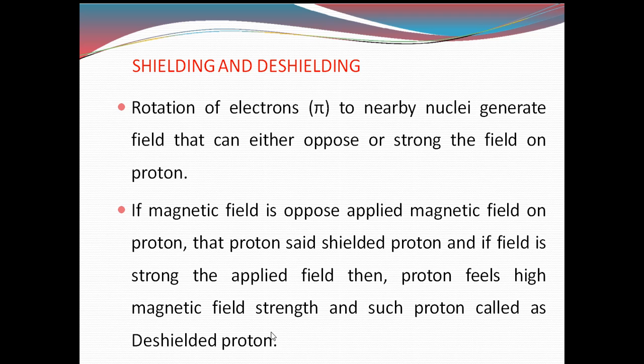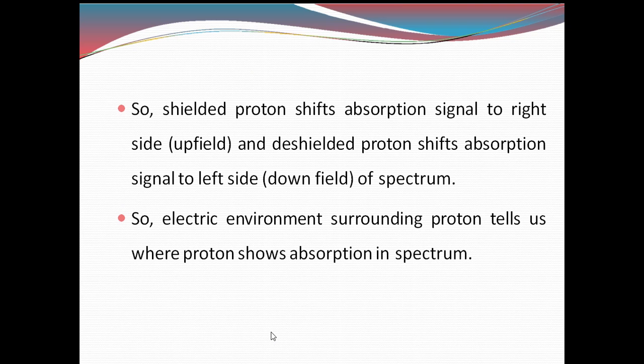So such a proton is called a de-shielded proton. So what will a shielded proton do? It will shift the absorption signal from left to right. That means it will show the signal at the upfield. And in the case of a de-shielded proton, it will shift the absorption spectrum from the right side to the left side.